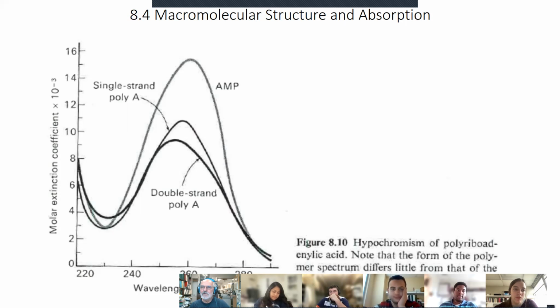Sometimes, okay? And the problem is that absorption in nucleic acids is much more dependent upon the structure. Is it monomers, dimers, oligomers? Is it a strand of single-stranded? Is it double-stranded? What is the structure of the nucleic acid? And it's shown in this particular figure from Van Holde, molar extinction coefficient versus wavelength.